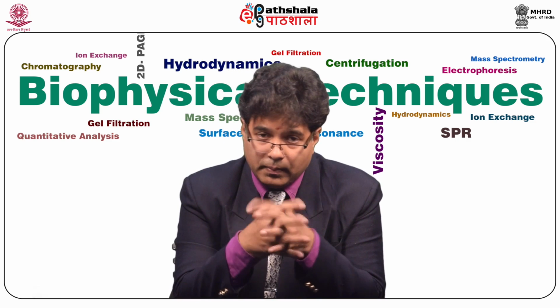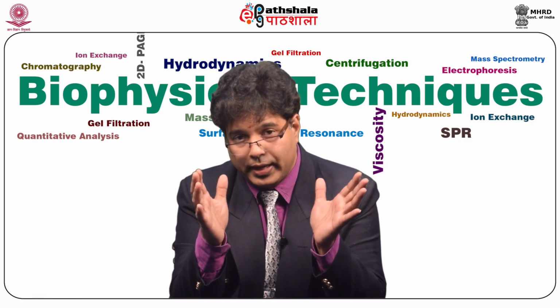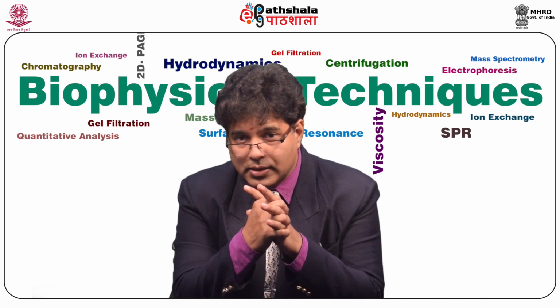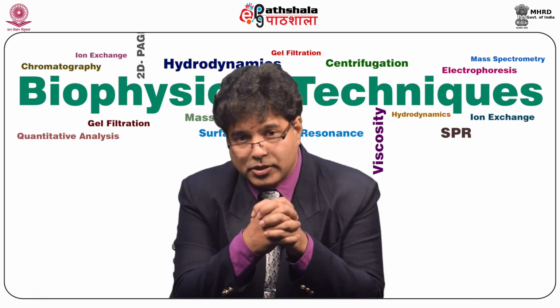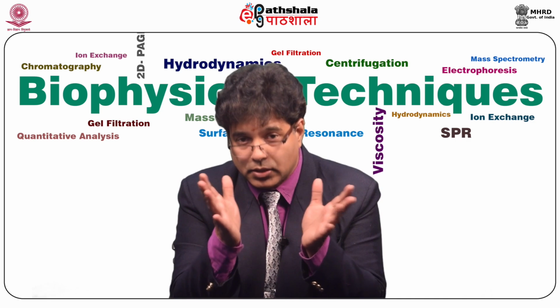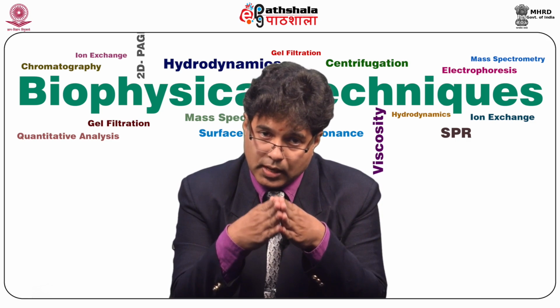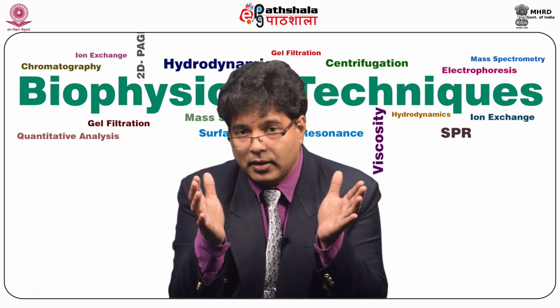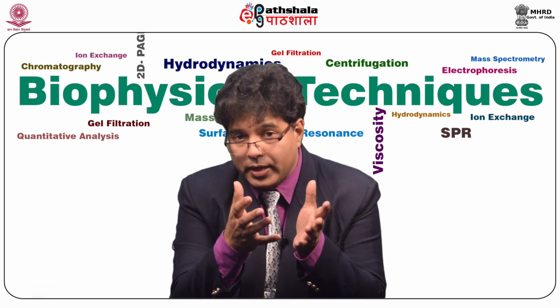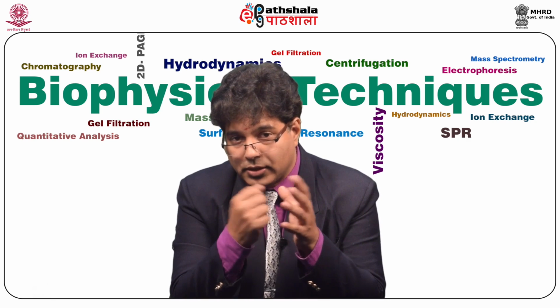Time of flight is another one, where a reflectron is used. Basically, the path of the ions passing through is increased so that you get a better resolution. Magnetic field deflection and time of flight can give us a somewhat different type of picture as compared to quadrupole mass spectrometry, but time of flight gives better resolution in the mass spectrum. This property allows us to get high-resolution data regarding molecules with high molecular weight which are multiply protonated. Molecules like proteins and peptides, which are multiply protonated, can be accurately measured and quantified using these instruments.